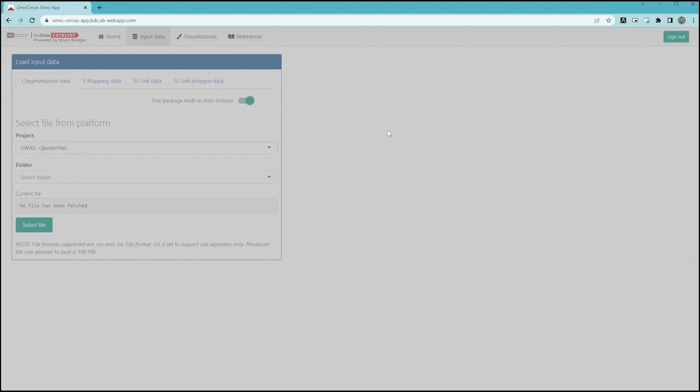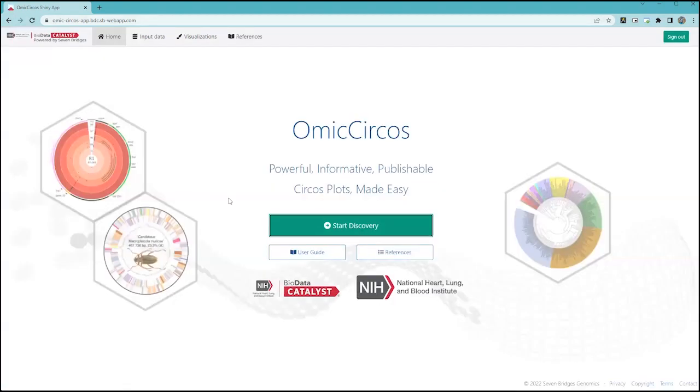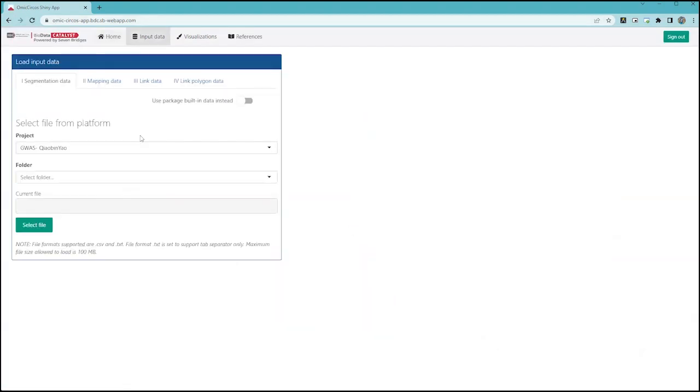Great question, Prithvi. He asked what kind of data should be given. I've never actually used it with GWAS data, but I'd like to try. Let me refresh this. I think I'm logged out. This example in particular is going to walk you through mRNA fusions, basically omics data.